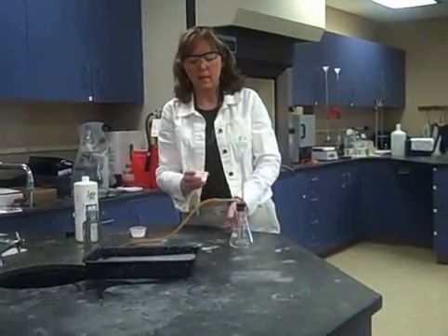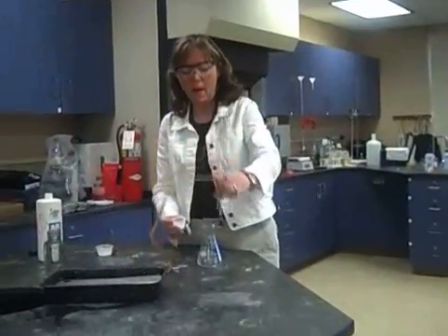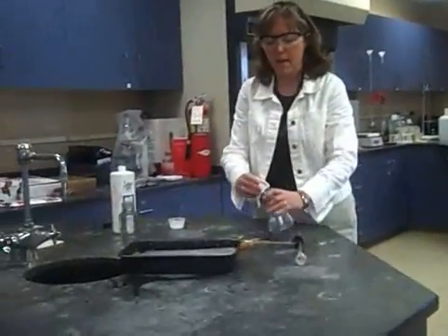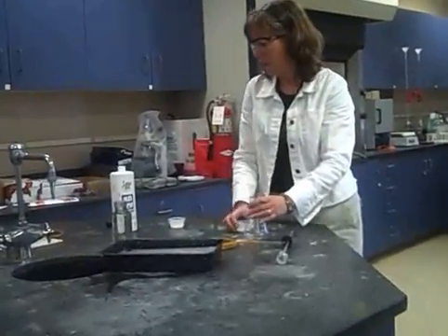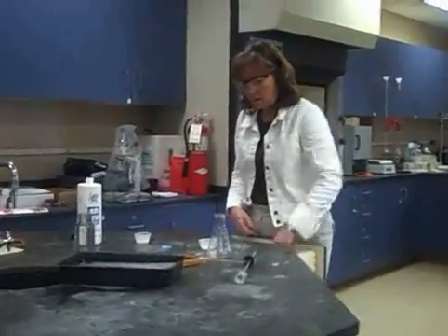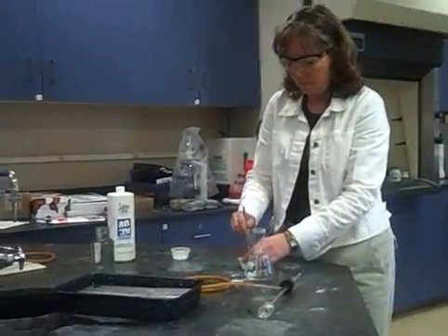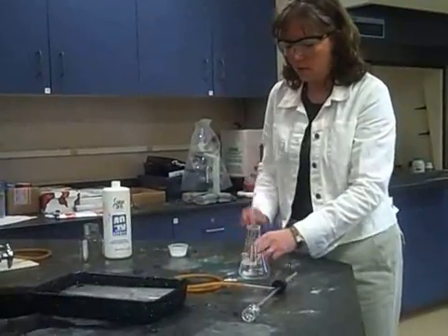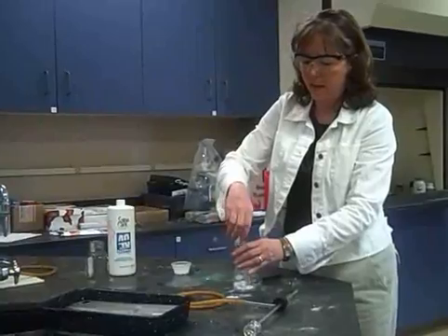I'm going to take the catalyst — potassium iodide — and we're going to open up the Erlenmeyer flask and coat the bottom of this with the KI, potassium iodide. You want to break it up and try to get as much surface area as you can. I'm going to put that in the bottom of the flask.